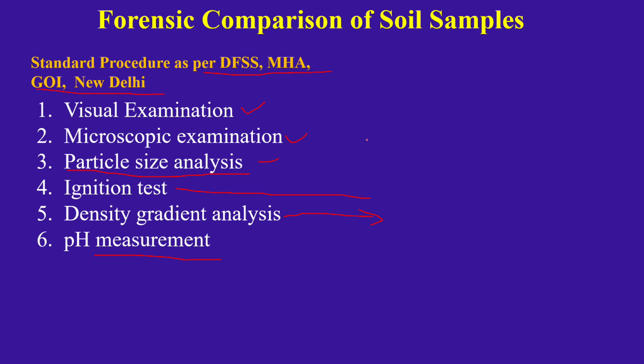So these are the techniques used for the forensic comparison of soil samples. I will try to make a separate video on each technique: visual examination, microscopic examination, particle size analysis of the soil samples, ignition loss, density gradient, and the pH meter.